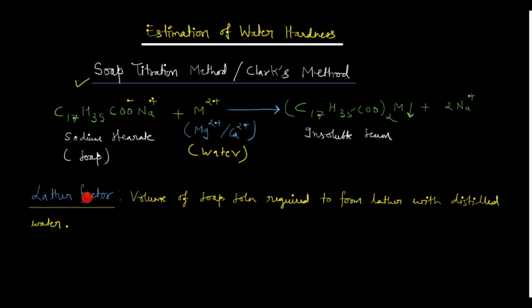So what is lather factor? Lather factor is nothing but the volume of the soap solution required to form the lather with distilled water. Here I have written distilled water, but you should remember this particular point, that distilled water should be of zero hardness, right? Zero hardness. Generally we say that it is of zero hardness, but it is not really possible.